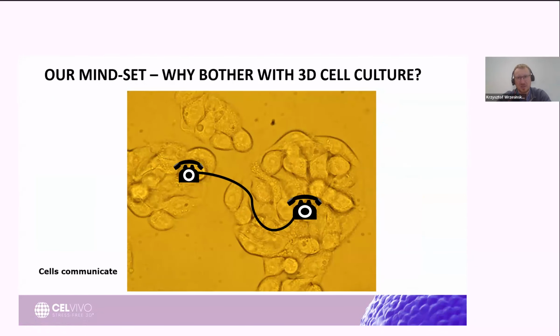From a historical perspective, we used to use monolayer culture, so-called 2D cell culture, to build our models. Those are fairly easy to operate and use very little complexity systems. That actually can be an advantage for us, especially during the analysis of data coming out from our experiments. However, the lack of complexity is also a limiting factor for those types of models.